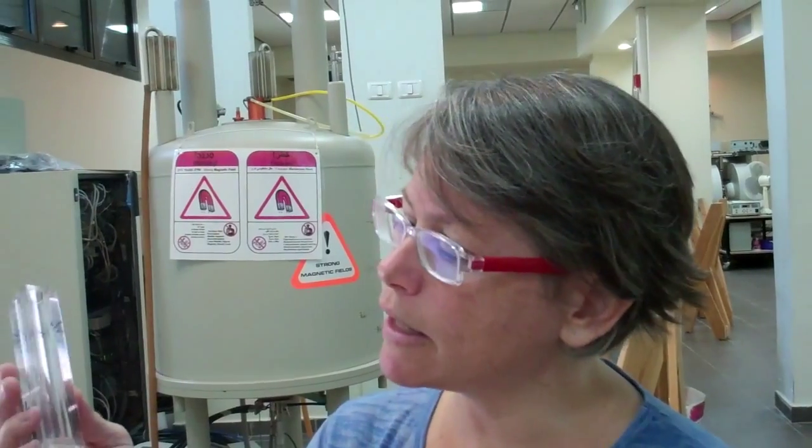To insert the sample, number three on the instruction list, we'll need a depth measure and a spinner. There's a marking here for five millimeter outer diameter NMR tubes. That is the size you should be using. This black line marks where the coil is located inside the instrument.